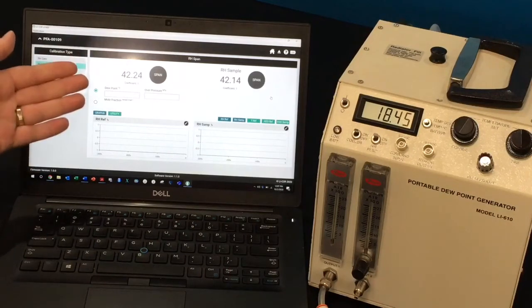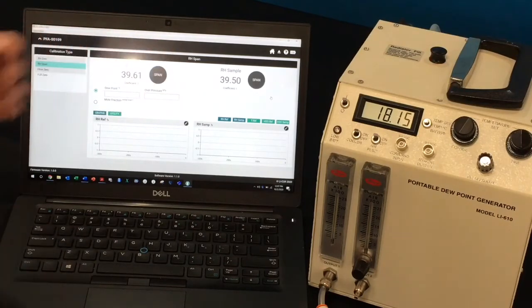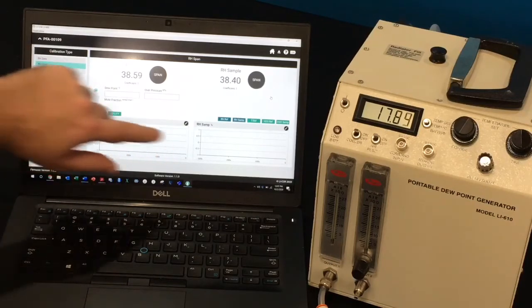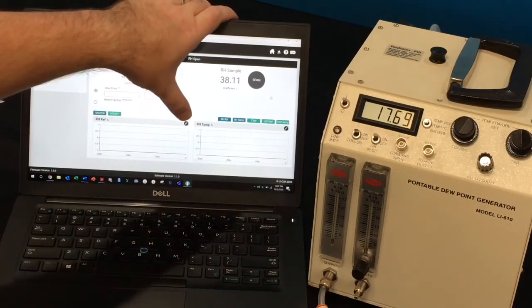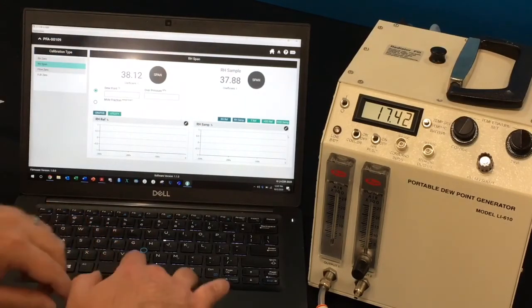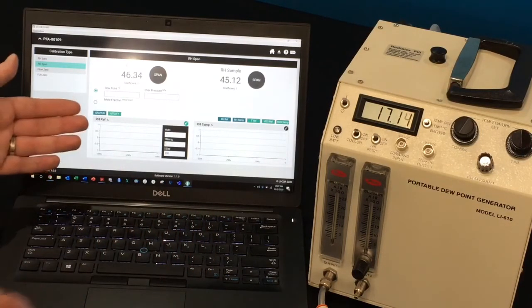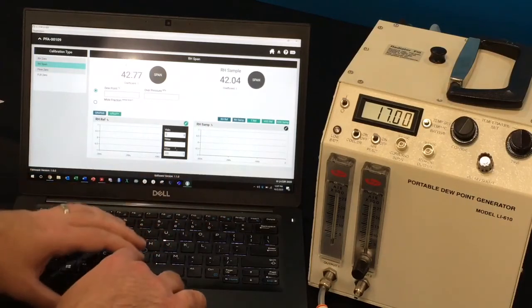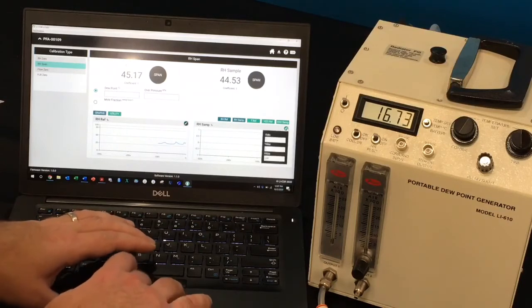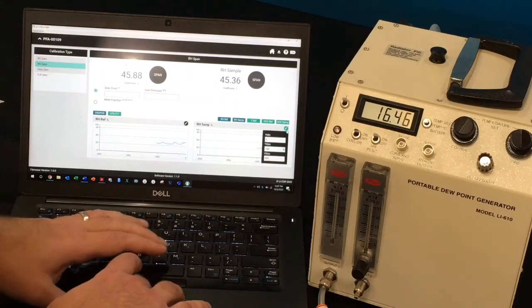We should see on the software that the relative humidity starts to change immediately for reference and sample. One helpful item is this chart down here where you can edit if you want to press the pencil icon in the top right corner of each graph. It will let you change the scale of this graph. So I'm going to set mine from 0 to 100 percent relative humidity. And that way we can at least identify where the relative humidity values are.